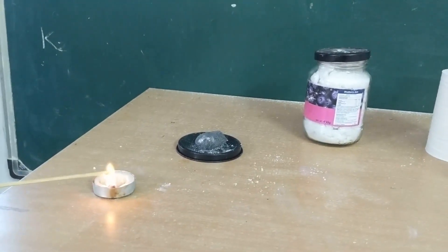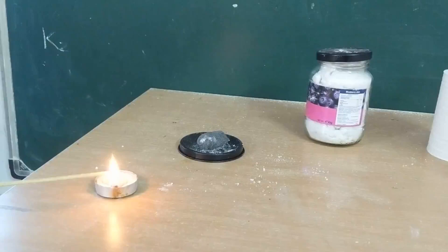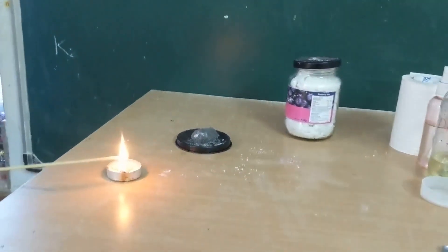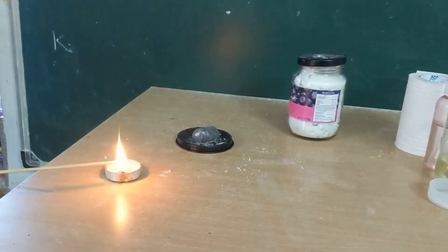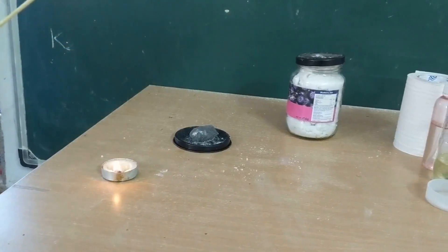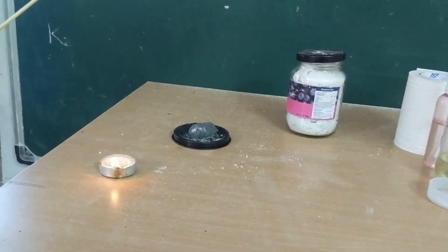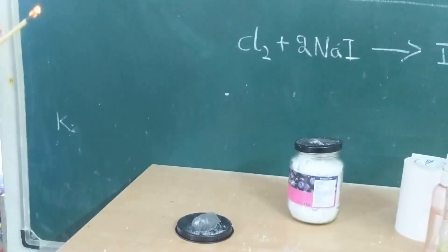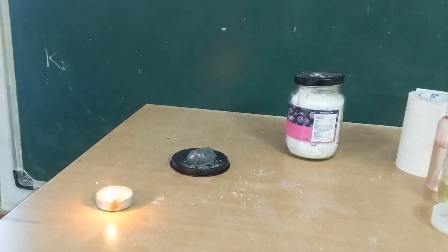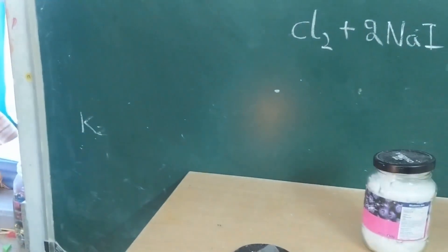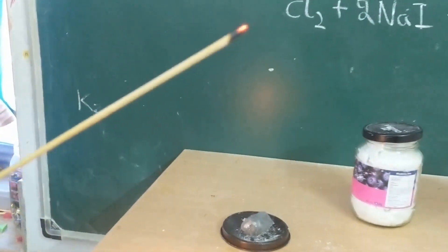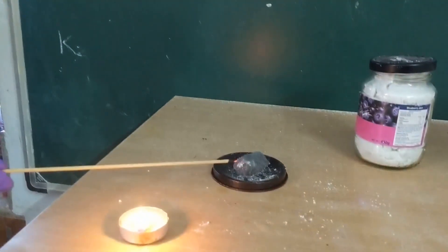I am lighting the wooden splint with a candle. Now it is glowing orange. Place it inside the mixture.